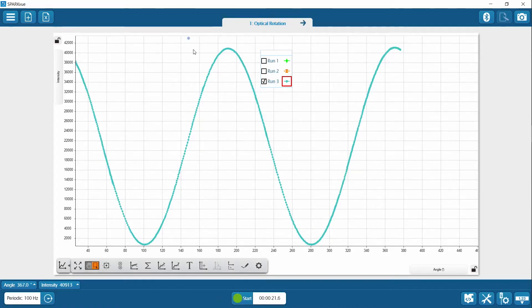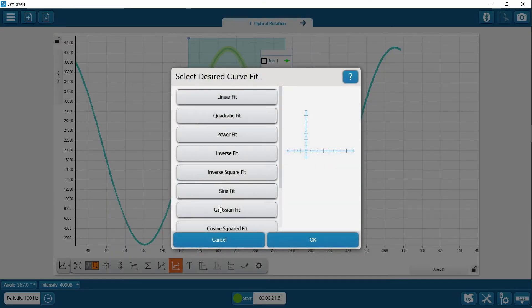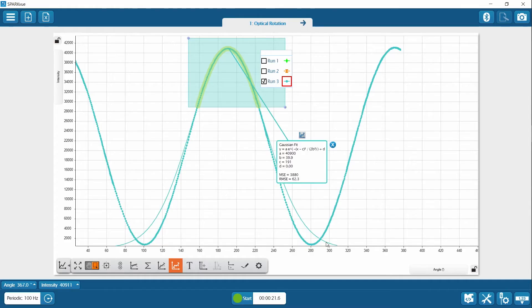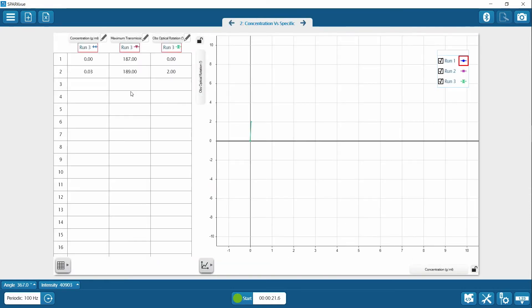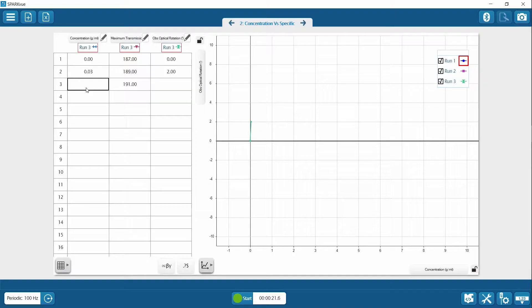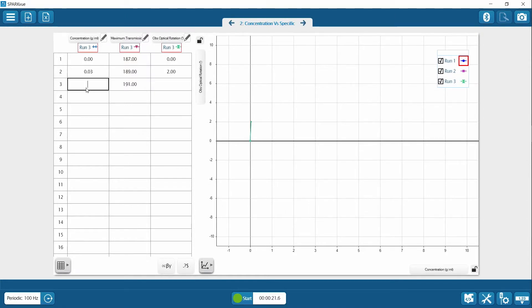We'll run the Gaussian fit, which is 191 degrees. We'll put that in the table. This is 6% or 6 out of 100 mils, and so that in terms of grams per mil is 100 times smaller, 0.06. And then we'll say the difference between 187 and 191 is 4 degrees.